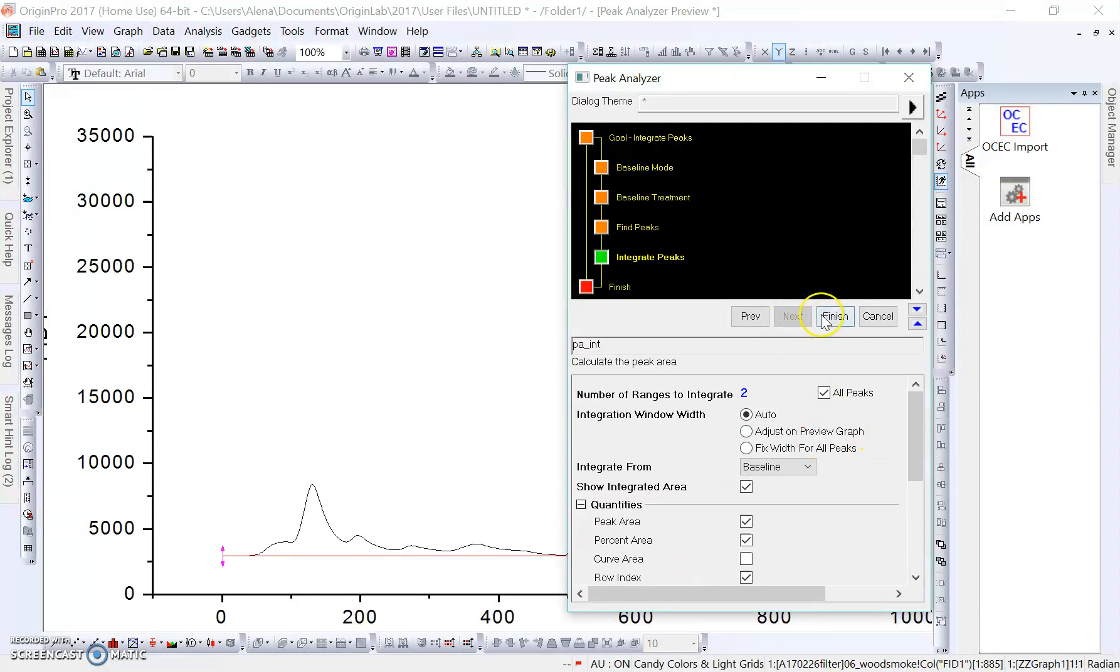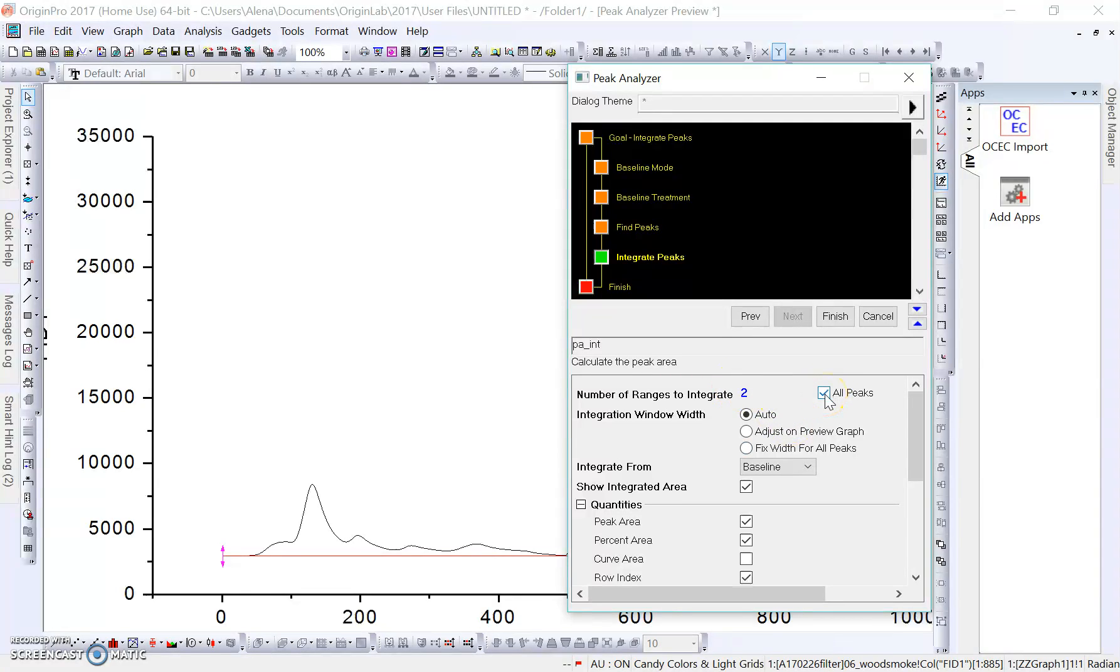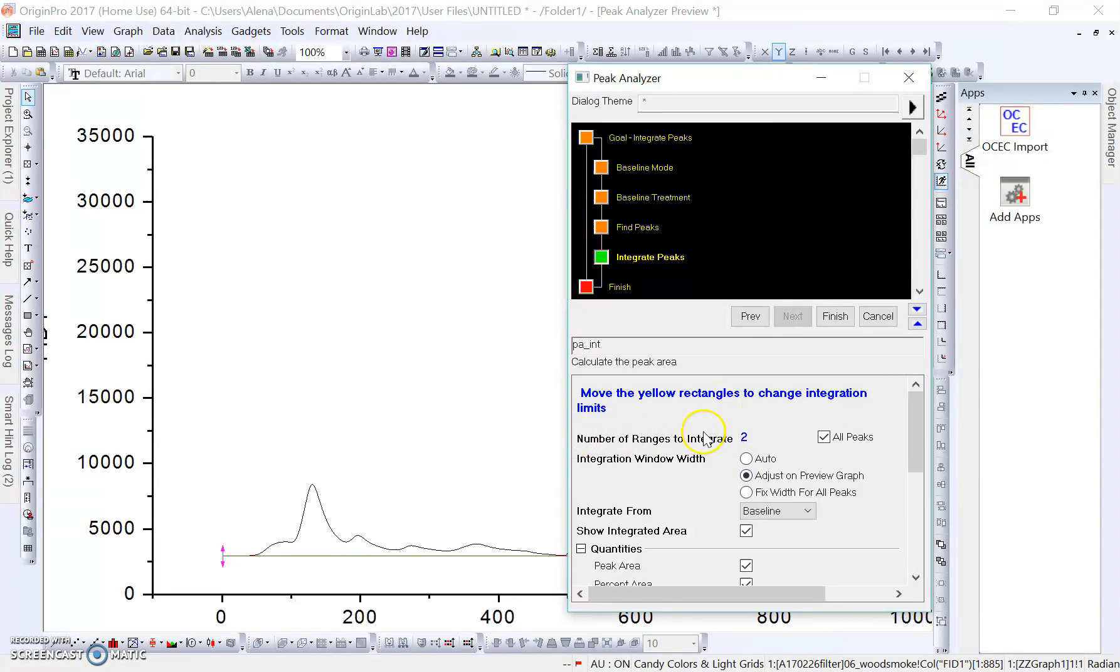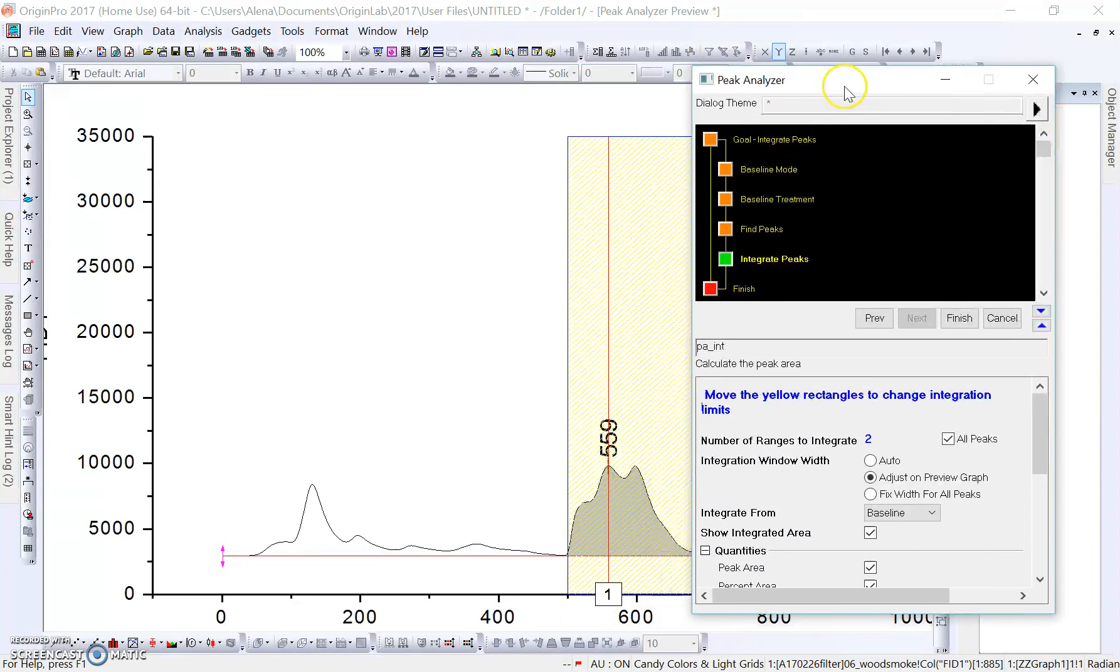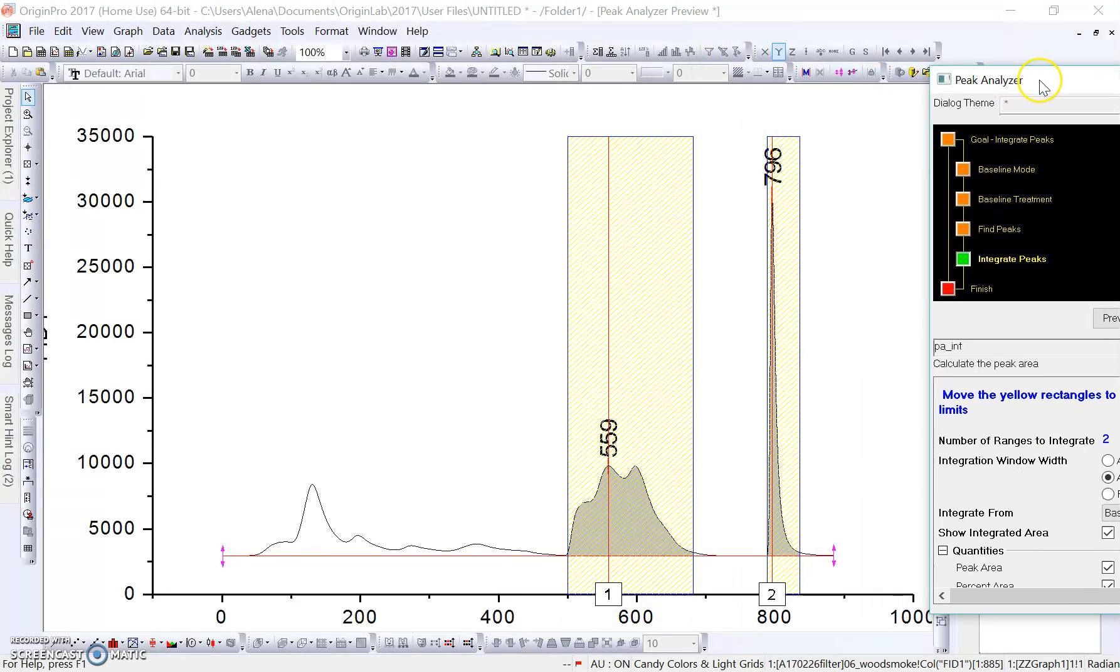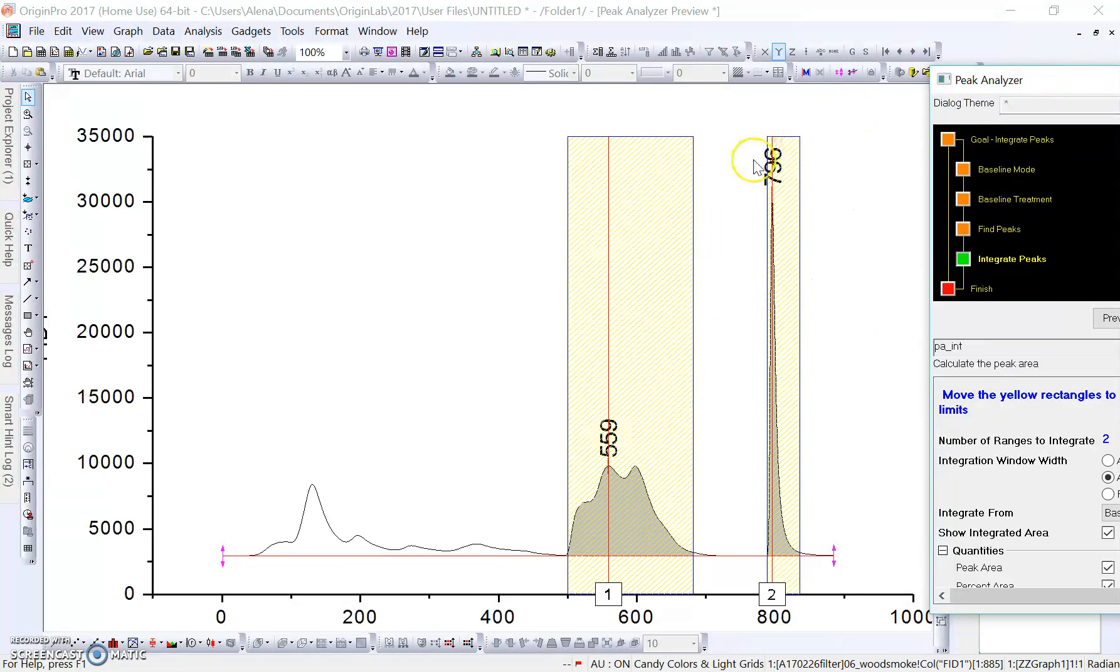We go to the next box where it says the number of ranges to integrate. We're going to keep this checked All Peaks, so it's going to integrate two ranges. We're going to set our integration window width to adjust on preview graph. What this allows us to do is, if I move this over to the side again, we can see two peak areas that it's integrating right now, correlating to these peak areas in the middle.